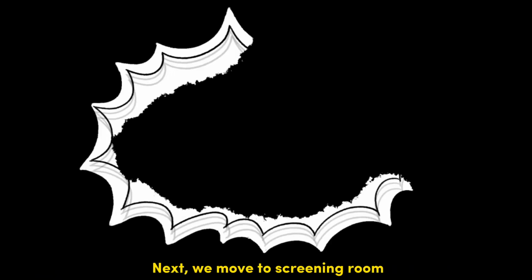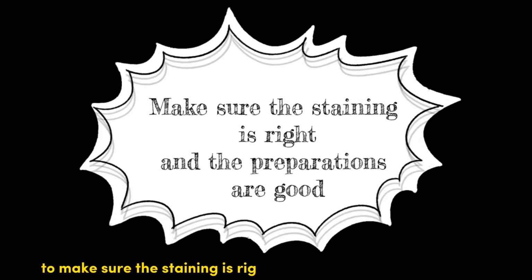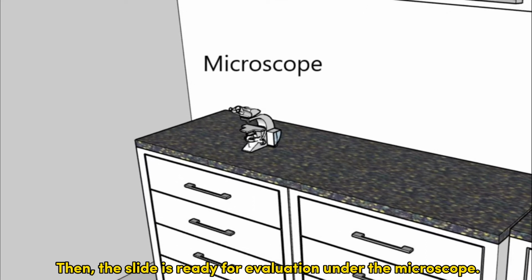Next, we move to the screening room. After the staining, the biomedical scientist will check the slide to make sure the staining is right and the preparations are good. Then the slide is ready for evaluation under the microscope.